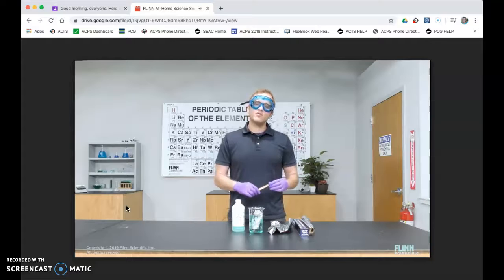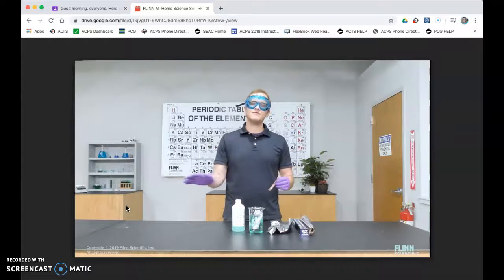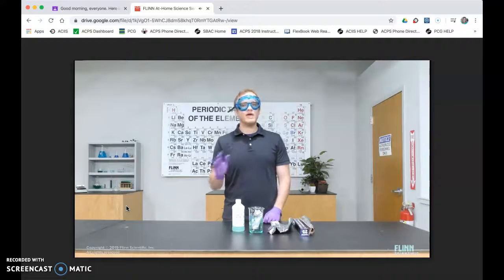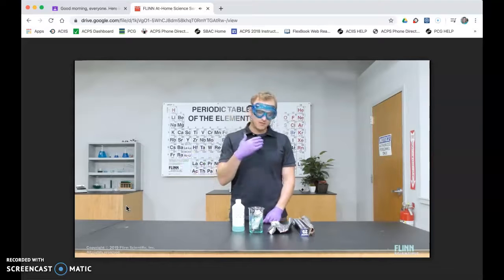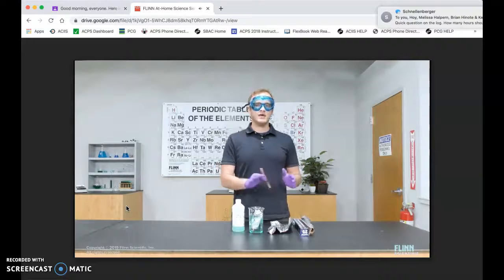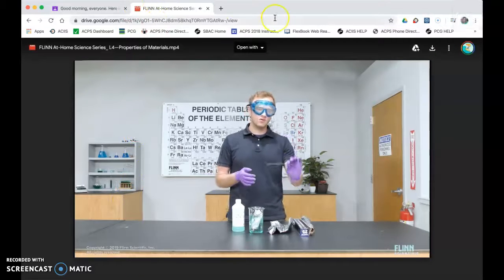Now, the metal that we saw that didn't have any reactions, it didn't react in any of the solutions, was copper. And so we decided to choose that as our metal of choice for school bus construction. The other metals we saw were quite reactive with most of the solutions. Some weren't as reactive as others. For example, aluminum might have been a good choice. We decided to go with copper because when we went online, we saw that it was widely available and also very cheap. So those two things combined with the idea that it wasn't reactive with any of the solutions, we thought this would be a good choice to construct our school bus.